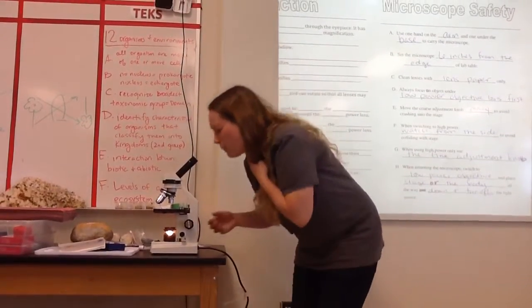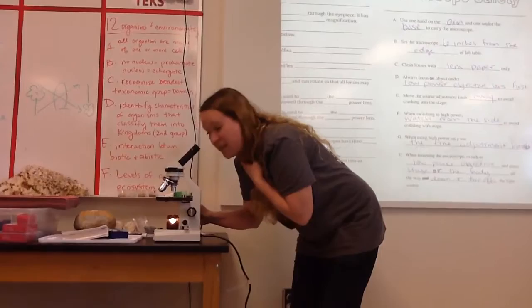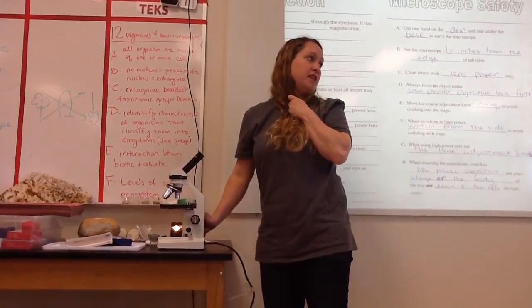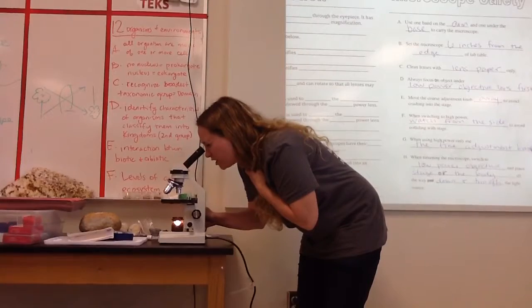All right, so my image is in the middle. I take my big knob, and I start to back up. I'm backing up, I'm backing up. Can you see the stage slowly moving down? You do it super slow, like a snail. Okay, so as it backs up, the image goes from a little bit blurry to clearer and clearer and clearer.